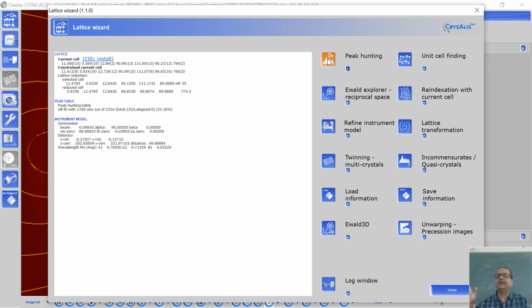If it has 5 sets, 4 sets, 10 sets, it will read all the frames. There are both good and bad things of reading all the frames. So normally we don't read all the frames. Good thing of reading all the frames is that it immediately tells you whether the crystal behaved properly during the entire data collection or not.